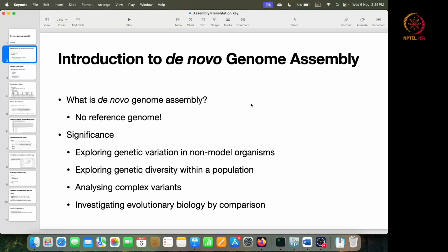In a previous demo, we have seen that read sequencing data can be aligned to a reference genome, and you can identify the different features that are present in the sequencing data by comparing the alignments of the reads to the reference genome. We can observe different insertions, small deletions, matches and mismatches in the read sequencing data as it is aligned to the reference genome.